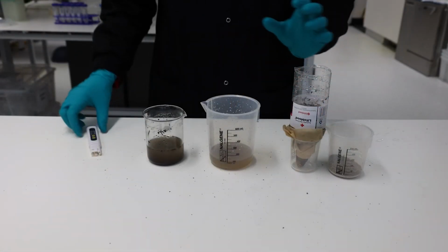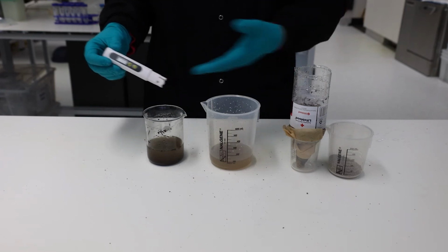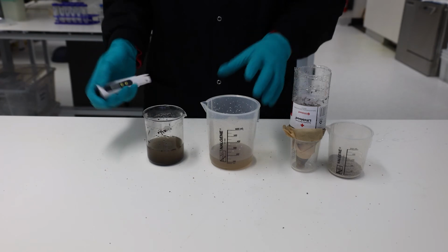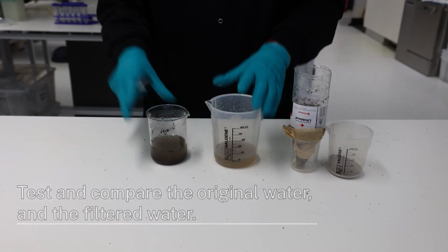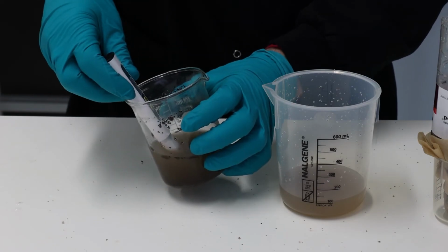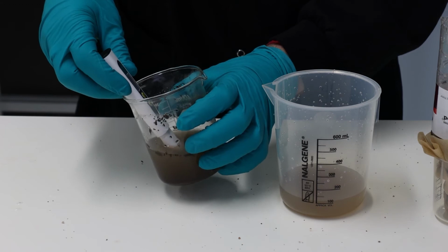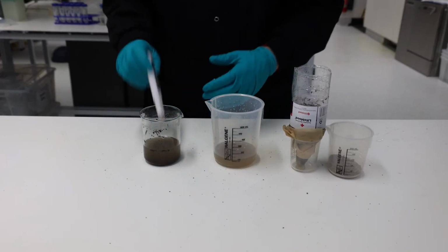So what we can do, we can take our TDS meter and measure if there was a difference between the before and after we filtered it. So you can see that they're quite different colours, but let's see what their TDS readings are. So before we filtered, we're getting a reading of about 450 to 500, which is quite saline.